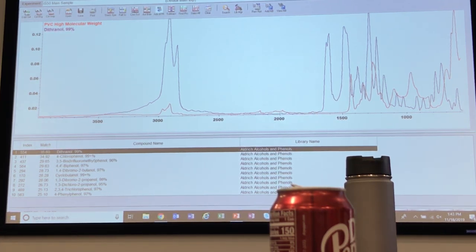So this came from what we call Dr. Bradley. He's our product manager back in Madison. He was a professor before, and he trains us when we start with the company. So when we train anybody, we always tell folks, match score is fine, but always do the eyeball test. Otherwise, it can definitely pick a lot of different things because it's just an algorithm that's running.